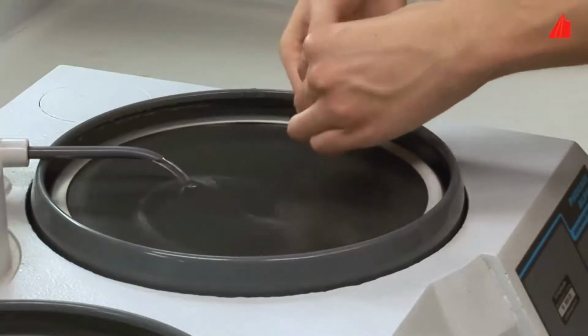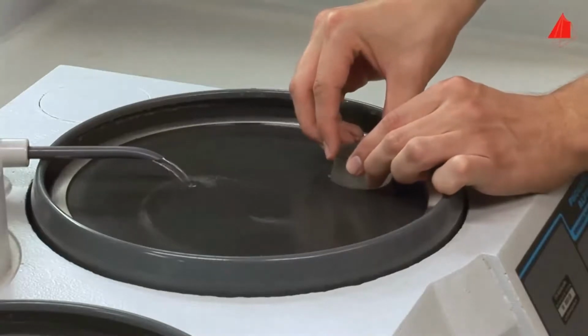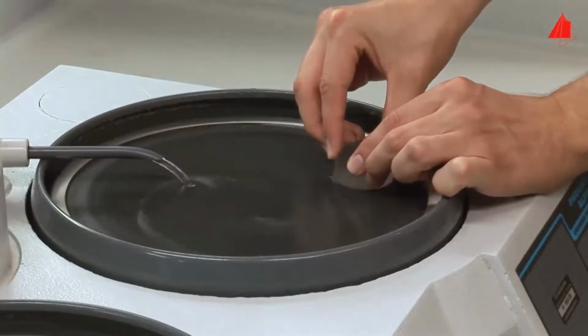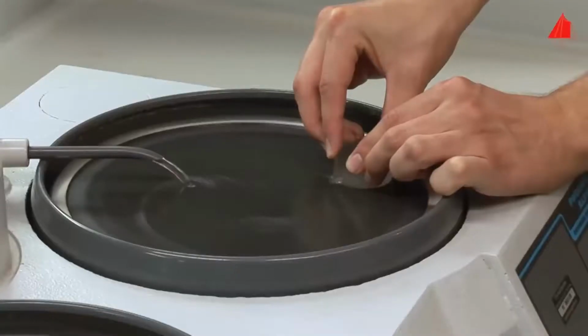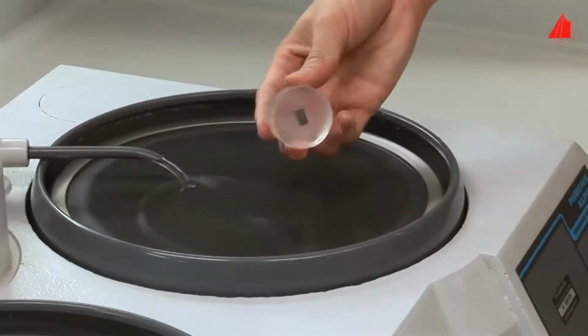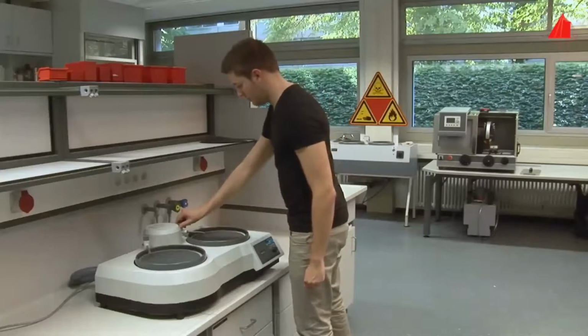Now comes the most important part, the preparation of the intended plane of examination. Our material tester begins with comparatively coarse 180 grit abrasive paper. He makes sure to press the specimen calmly and evenly onto the abrasive paper, compensating the tendency for the sample to tilt. He also makes sure not to grind his fingertips accidentally. Now he has achieved an even, relatively rough surface. The specimen is ready for the next step with finer paper.